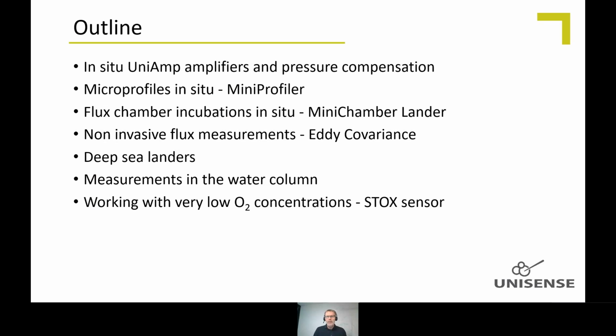So today they will be about the in situ systems, and all our in situ systems have one thing in common: they use the in situ Unisense amplifiers for mounting the sensors and for establishing the pressure compensation. And I will get into detail with this first. Then I'll get into detail with the mini profiler and how to measure microprofiles in situ. Then go to the flux chamber lander and show how that can be used to measure sediment water fluxes. The third way we have to measure sediment water fluxes is the eddy covariance technique. I will get into that as well.